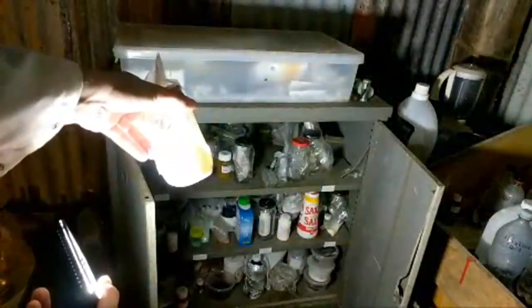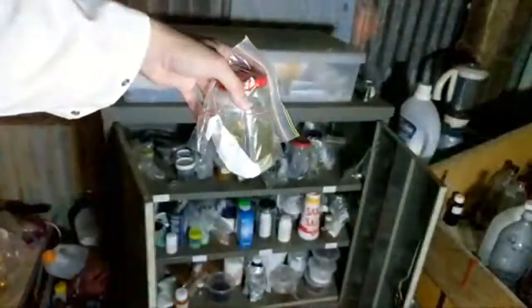All right. Let's have a look in here. What do we want? That is looking really yellow. I should do something about that. That is not good. Have a look at that. Sorry, I've just noticed this. This is a good safety demonstration. Have a look at how yellow. Does anyone want to tell me what this is and why I don't enjoy the fact that it's bright yellow? Oh, you can't even see it well. How do I place this light? Yeah, yellow is bad. All yellow chemistry is bad. So I should do something about that. That's so yellow.